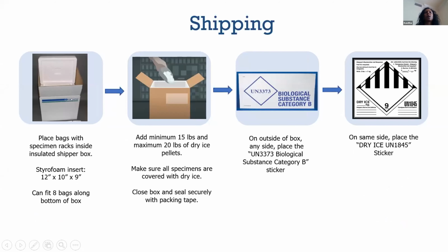These are the boxes. They're going to be sent to you by Therapack. Based on the size of this inside styrofoam, you should be able to fit 8 bags, which is about 80 specimens along the bottom of the box. So you might not have 80, you might have less. It should be a large enough box to put a large number of specimens.